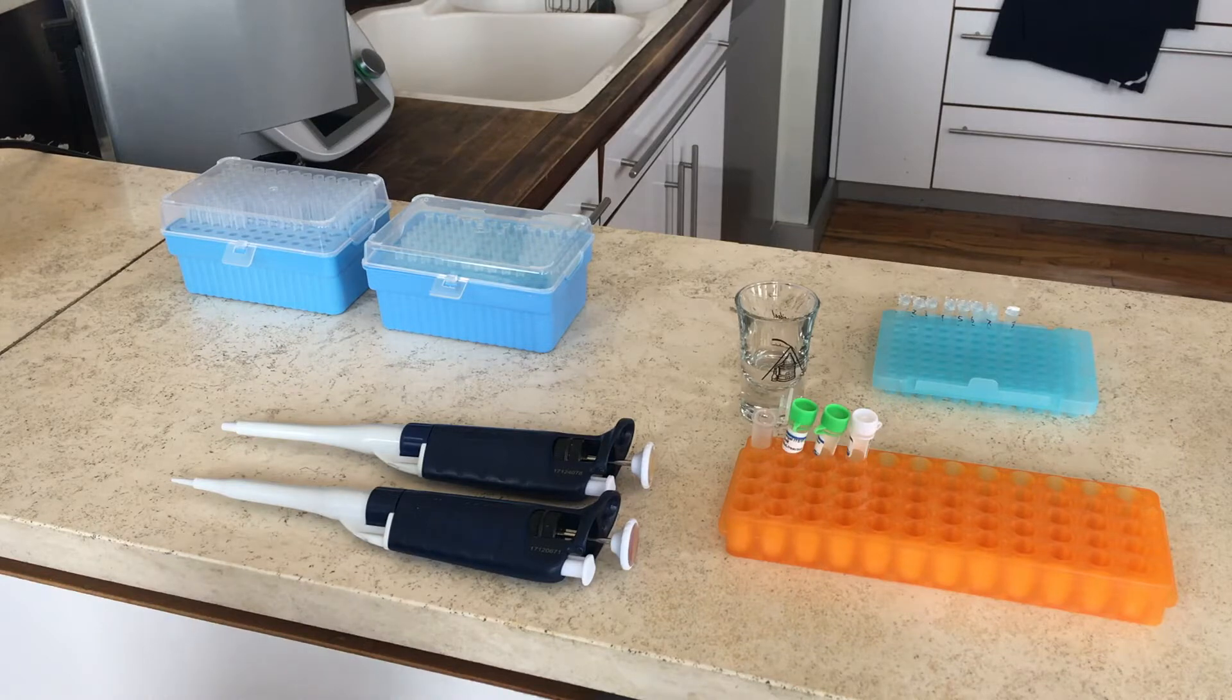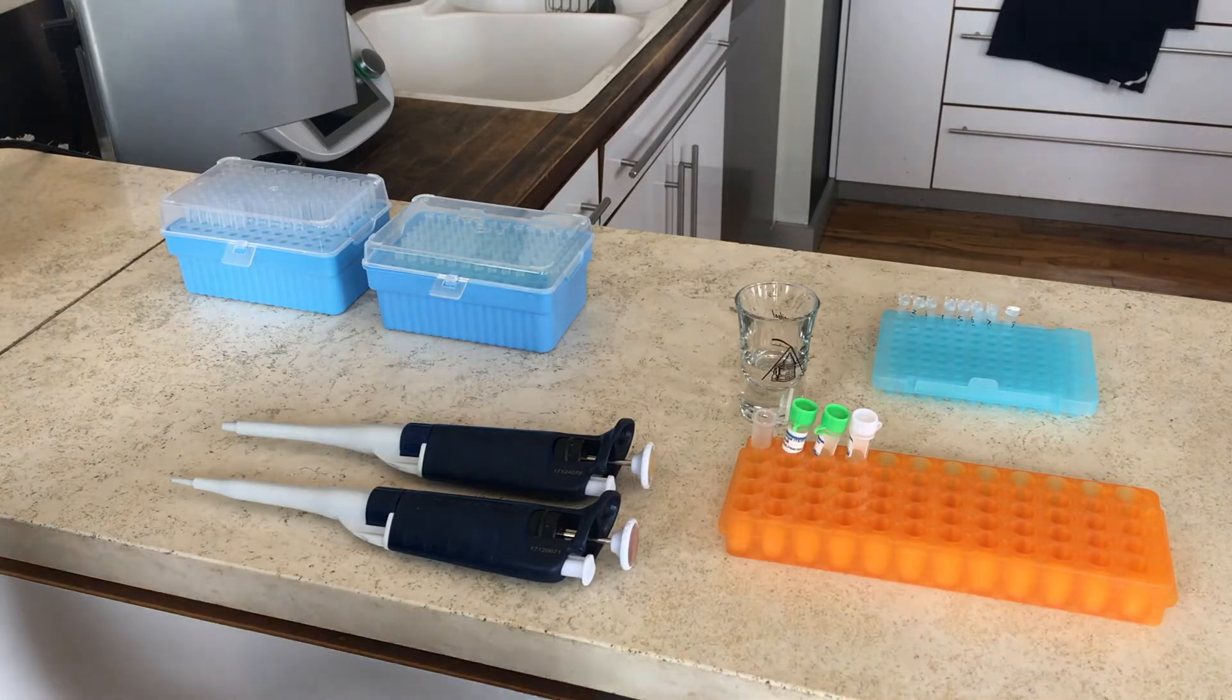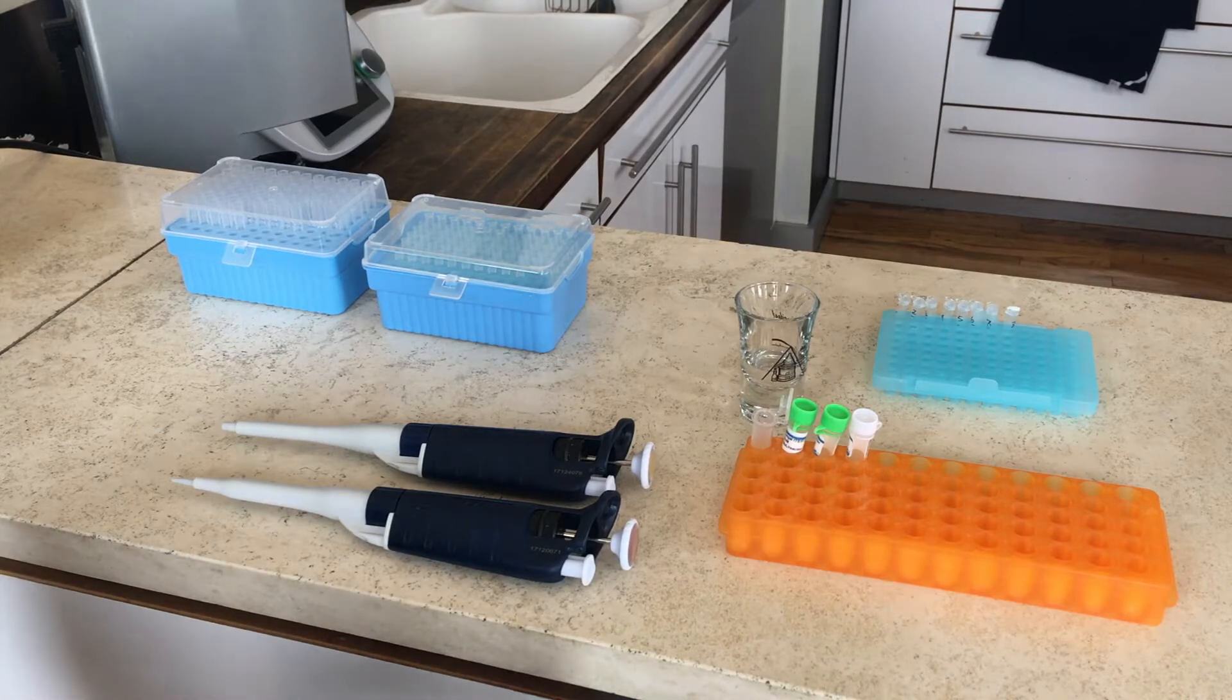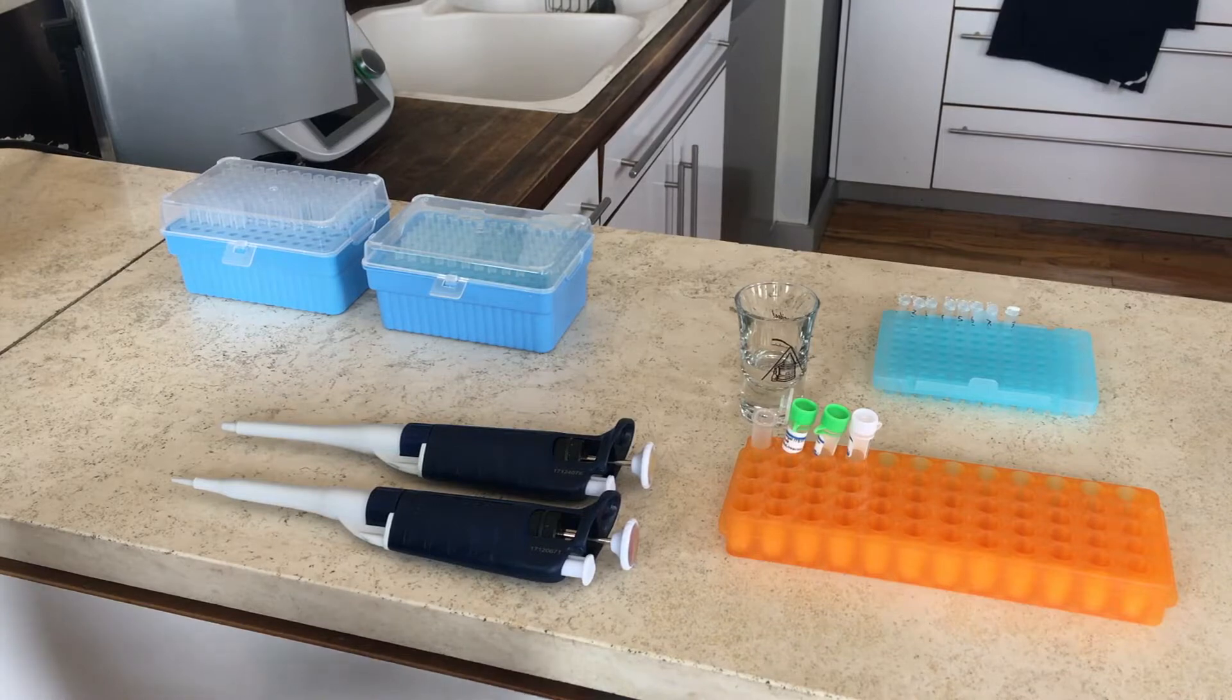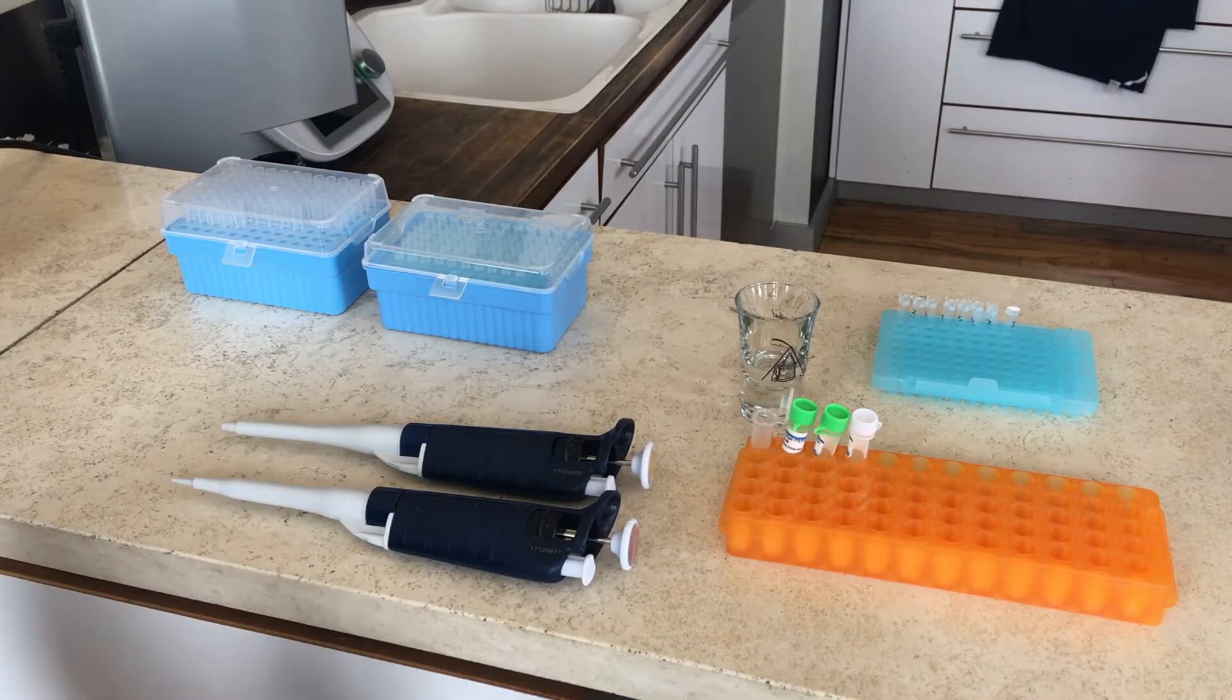The reason for that is my lab would like 10 microliters for forward read and 10 microliters for a reverse read, and then we're going to need an extra 7 for the gel electrophoresis. So that's how I get to that number. And if it's 27 per sample, you have to multiply that by 8 to get the final number of mix that you're going to need.